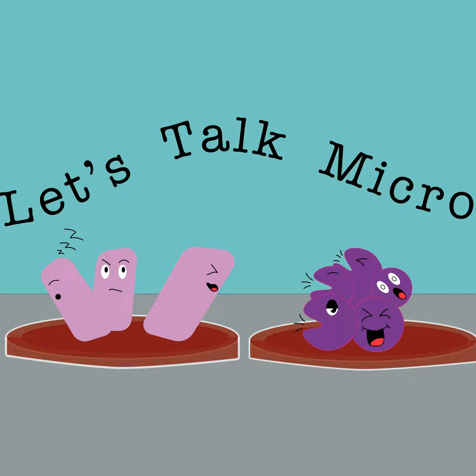I provided them with materials to dispose of the methylene blue safely, and there were some things that I had them bring back so we could dispose of them. That way they could stain with methylene blue, do the rinsing, and then look at it under the microscope. They took pictures and sent me the pictures. So they had to point out to me where the organisms were, where the bacteria were. And I had individual Zoom meetings with each student where it was their responsibility to show me what they uploaded, and they would then have to circle the bacteria or point out the bacteria.